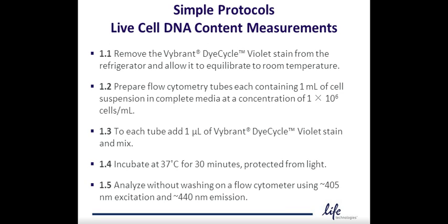Protocols for labeling with these live cell dyes are very simple. They are DNA selective, so there is no need to add RNase. The labeling is very simple. You have cells in suspension, you add the dye, you incubate, and then you acquire. And it's very important to acquire without washing.